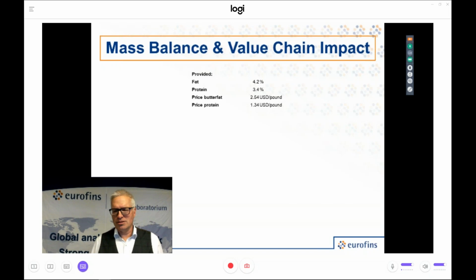I was focused on the amount of cheese, the amount of butter. I was not that focused on the site laboratory. So changing business to this world of analytics, I've become much more aware of the impact of the calibration procedures, and I've become much more humble to the required knowledge and competences necessary to run the labs and the dairy operations, and much more humble to the competences necessary to provide efficient and valid KPIs to the dairy operations.